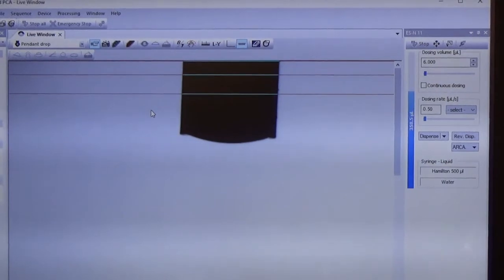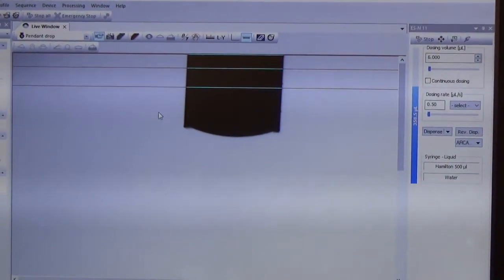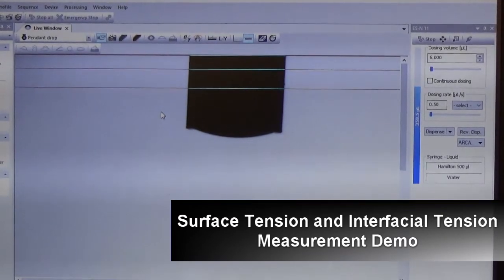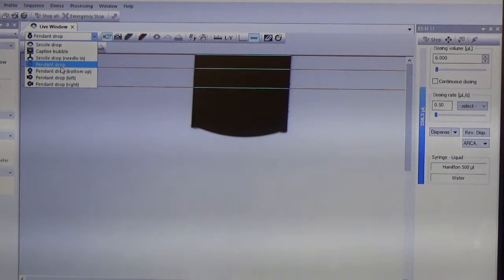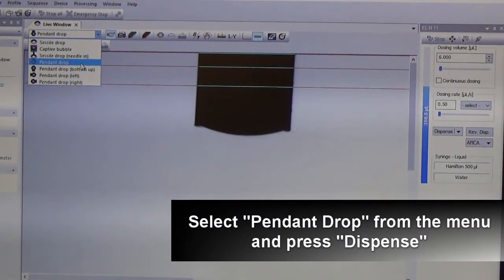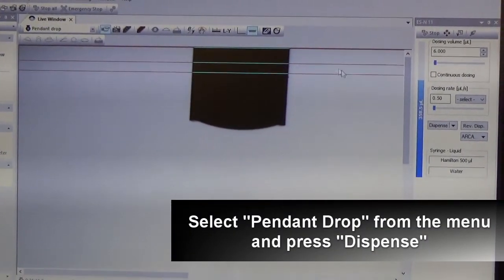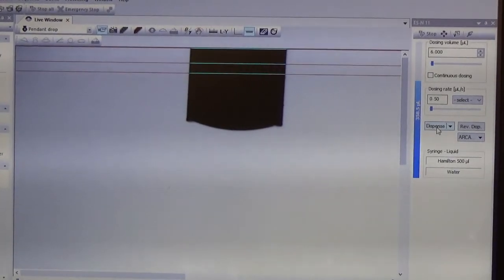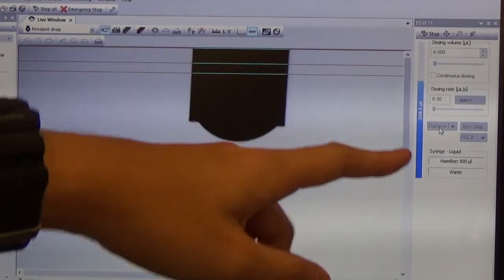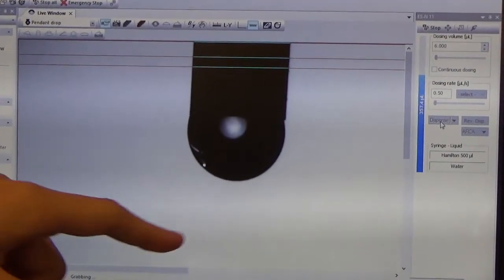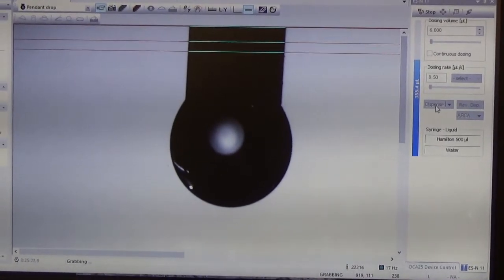Now we are going to measure surface tension as well as interfacial tension. Select the pendant drop method from the menu, then press the dispense button and you will be able to see the water being dispensed out from the syringe.